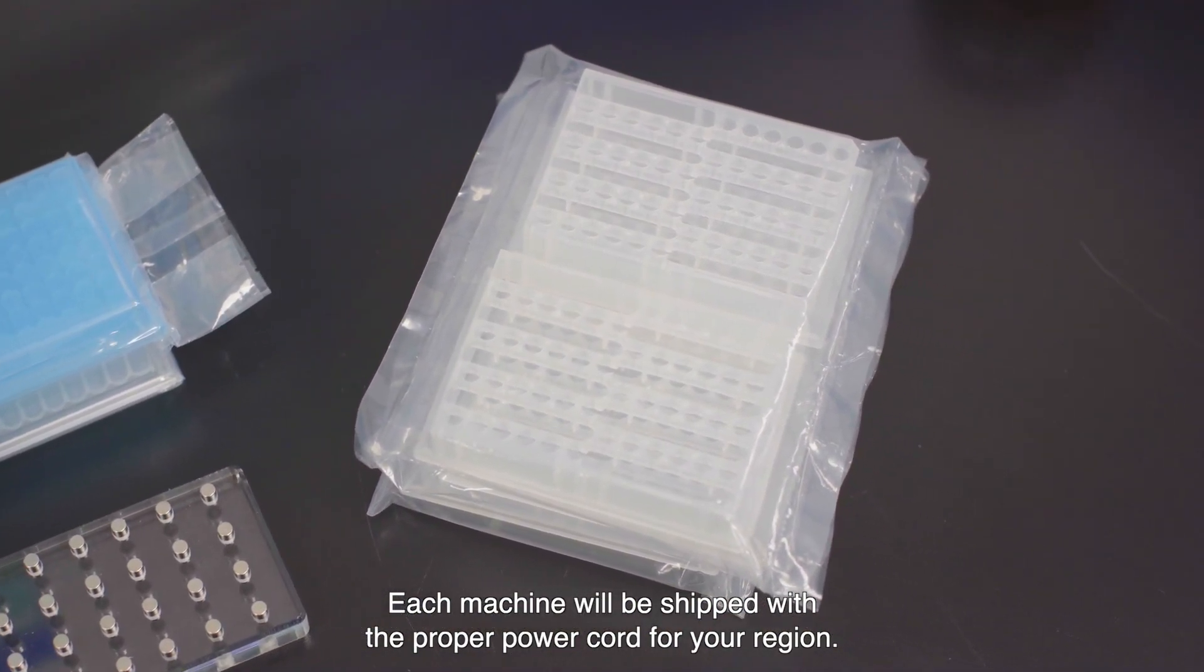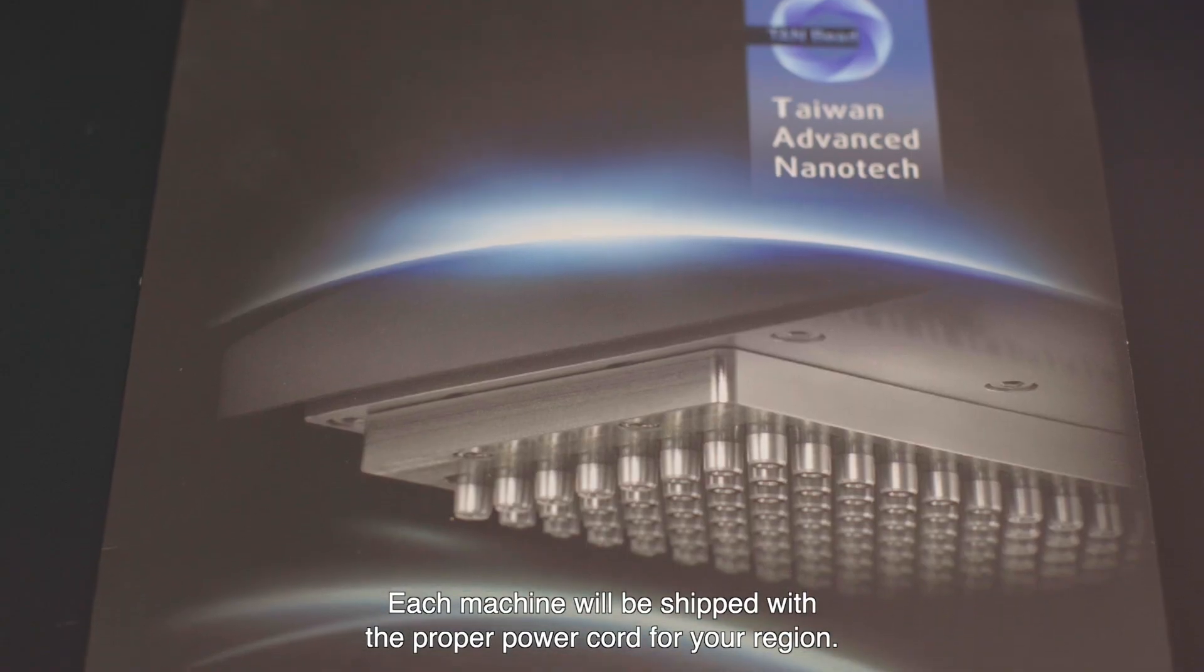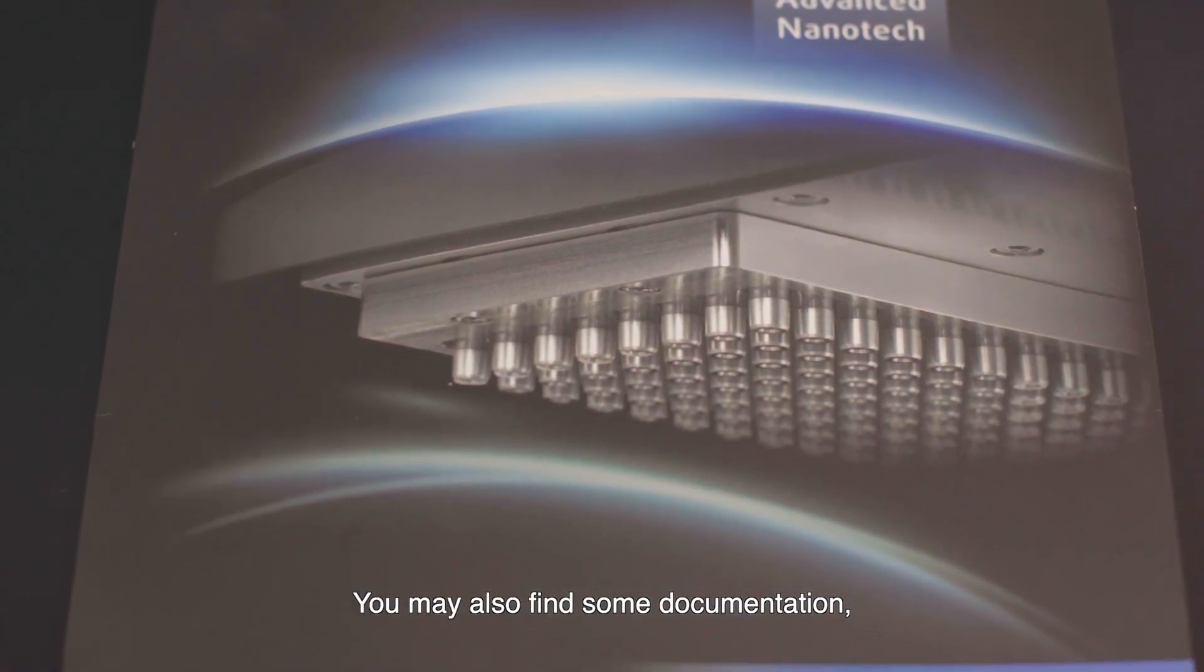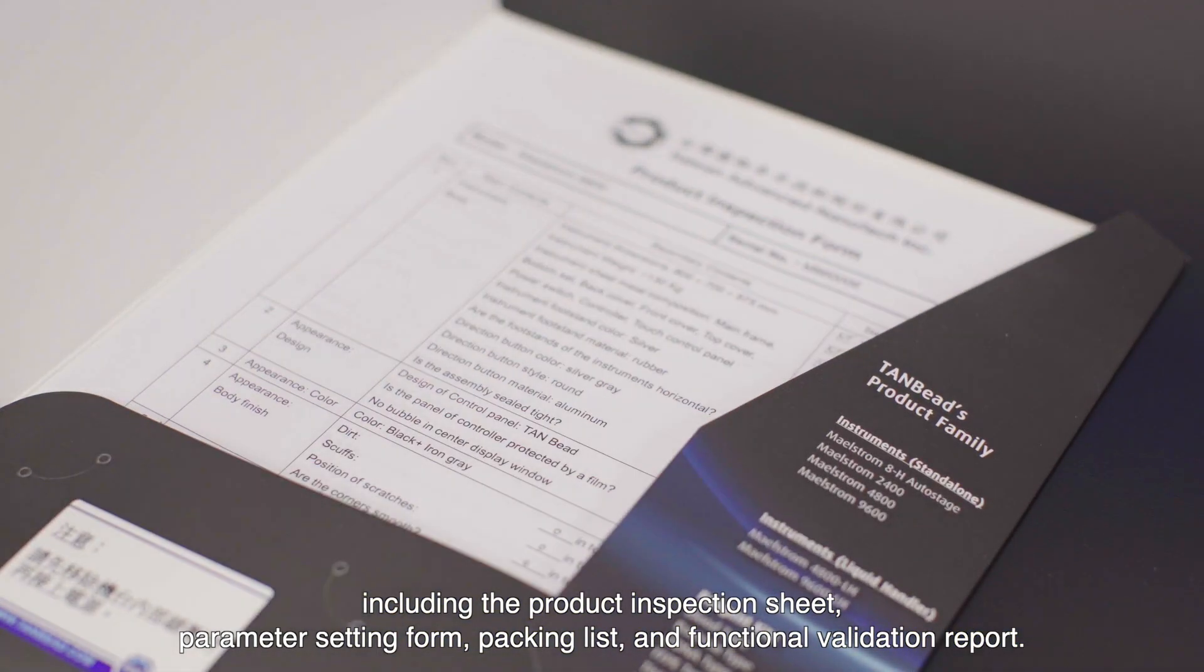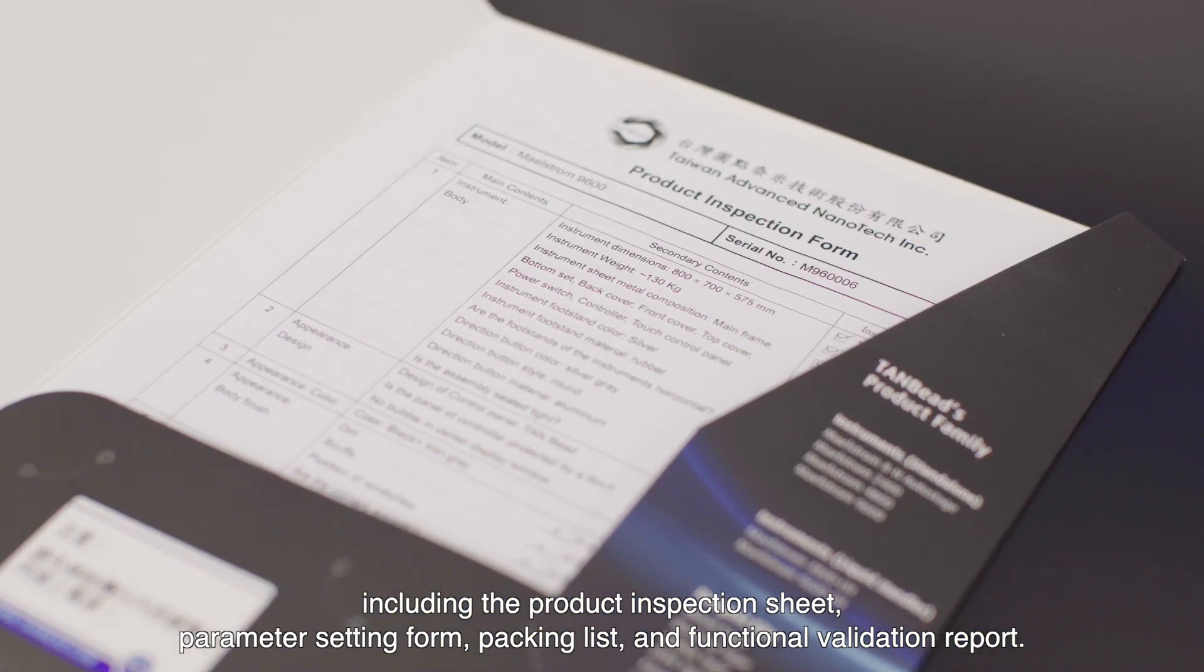Each machine will be shipped with the proper power cord for your region. You may also find some documentation including the product inspection sheet, parameter setting form, packing list and functional validation report.